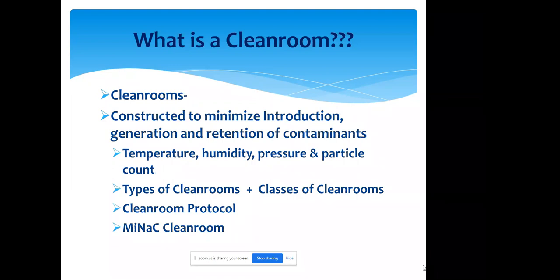So you don't just build a clean room because you want to build a clean room. First, you have to identify what it is that you want to do in the clean room. What kind of processes are you going to do before you decide to build a clean room? And then you have to identify what are the problems that you are going to encounter in order to achieve your goals.